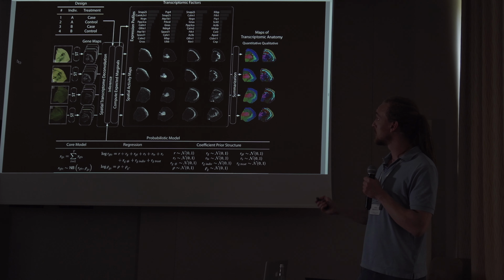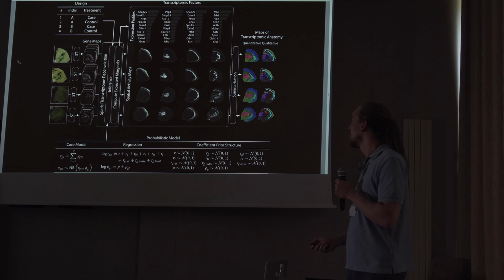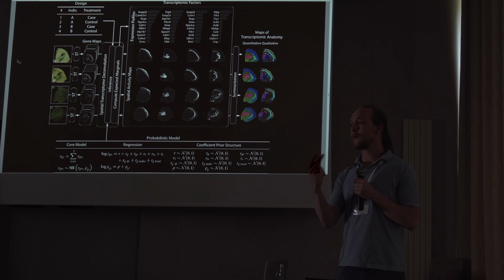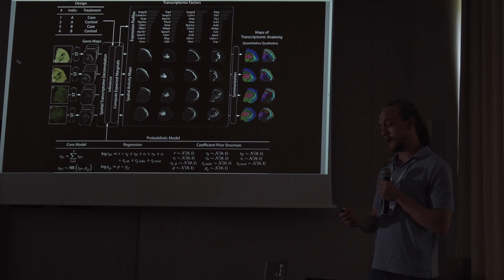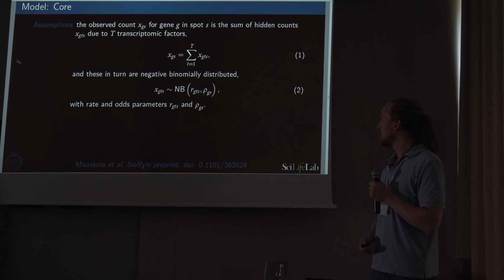I also want to note that even if we reduce the information from about 20,000 genes to, say, 20 factors, of which 4 are displayed here, it is still useful to summarize that information such that it can be perceived at a glance, using the techniques I spoke about initially. And this I explained already.